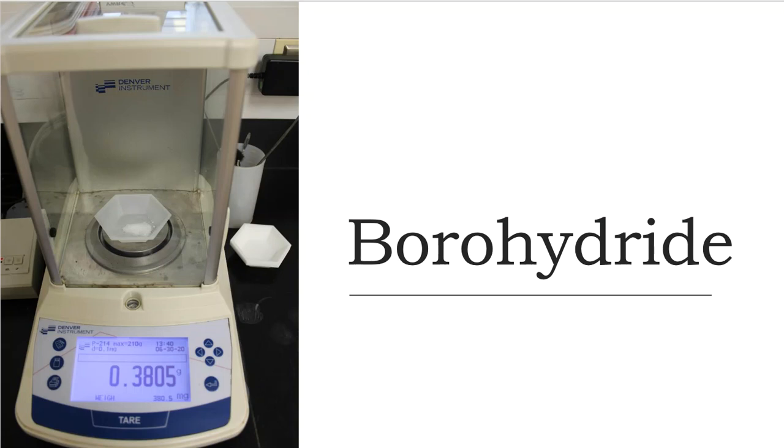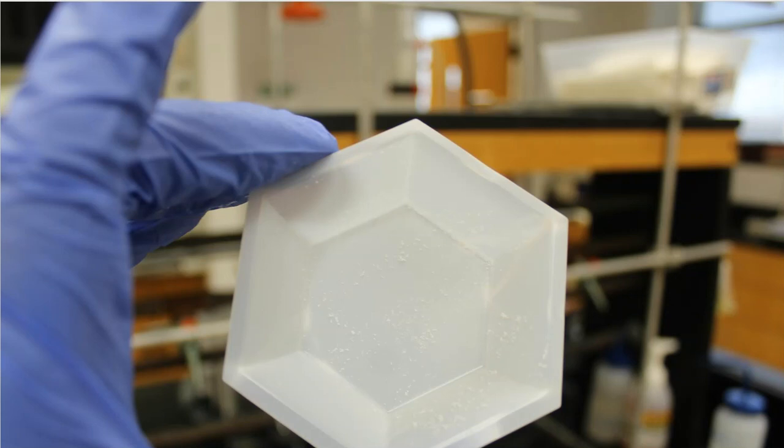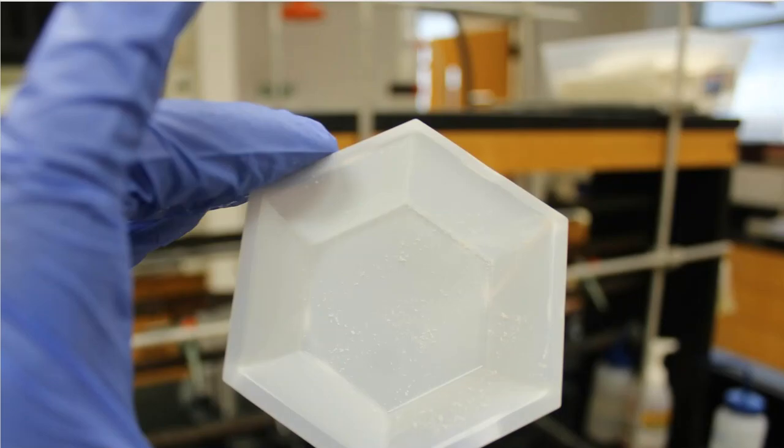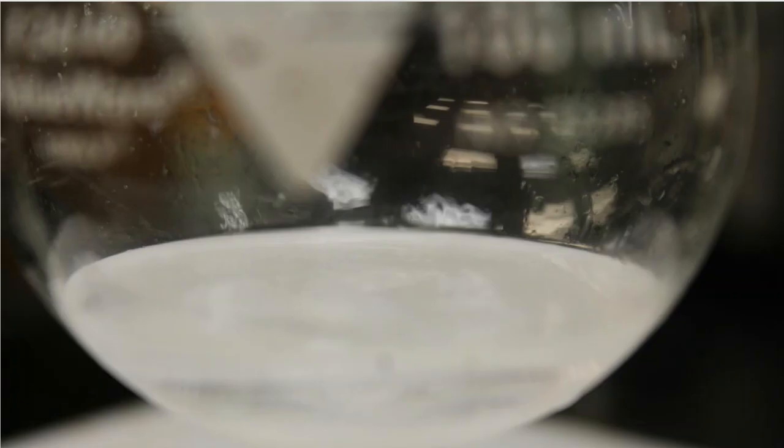I'm then going to transfer this sodium borohydride into that boiling flask that had my 1-hexene and my THF in it. So when I do that, I have a little bit of residue that's left over, and that's why I was okay with this amount being a little bit over. I knew that not all of it was going to transfer. So I overshot it here because in the transfer, I'm going to leave some behind, and I'm just going to trash this. I don't need this. I'm not going to worry and waste my time trying to scrape all of this out. I'm not crazy. And then I just dump in what is there into my boiling flask.